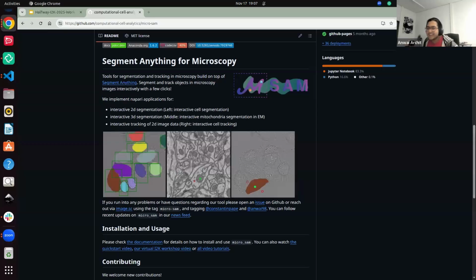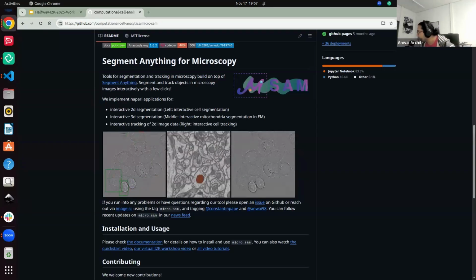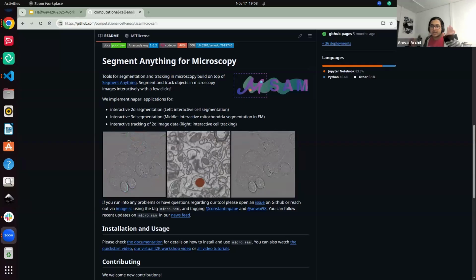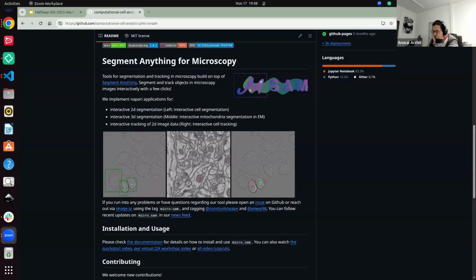I love that. So this was presented recently at ICCV. This was a paper with Anna Kreshuk's lab. Let me send this over here. The idea, in a nutshell, is that there are artifacts which pop up, and these could pop up for several things.